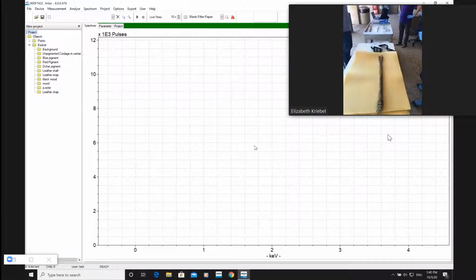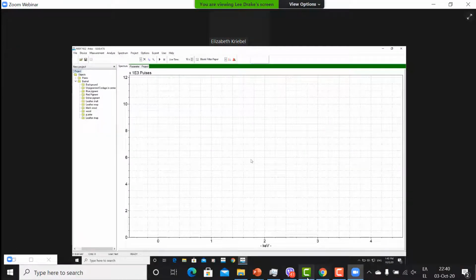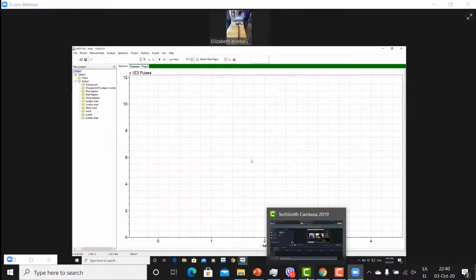Plaster. Oh yeah. Calcium carbonate. Maybe this was a victim of a remodeling project, and the object wasn't covered or something. That's a sad thought. Someone spraying plaster. The only thing I can say is plaster. Could be accidental. They could have been working with plaster on something else, and this was just nearby.